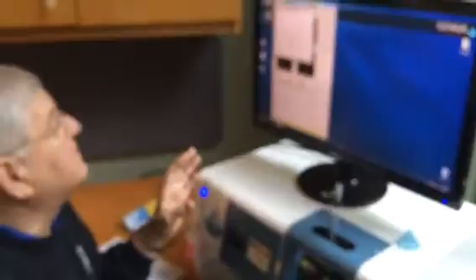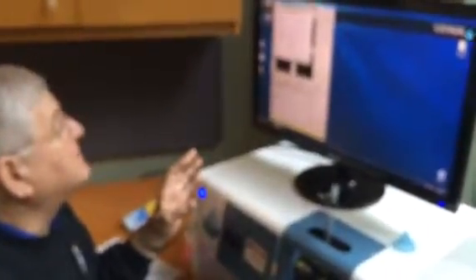and then go to context. So that's the part that I didn't do. Stop and think about that. Once we do all the hardware setup and we change the filter, syringe, and everything, we're done with the hardware setup. So now we need to go to the context. The first one that we did was capture.